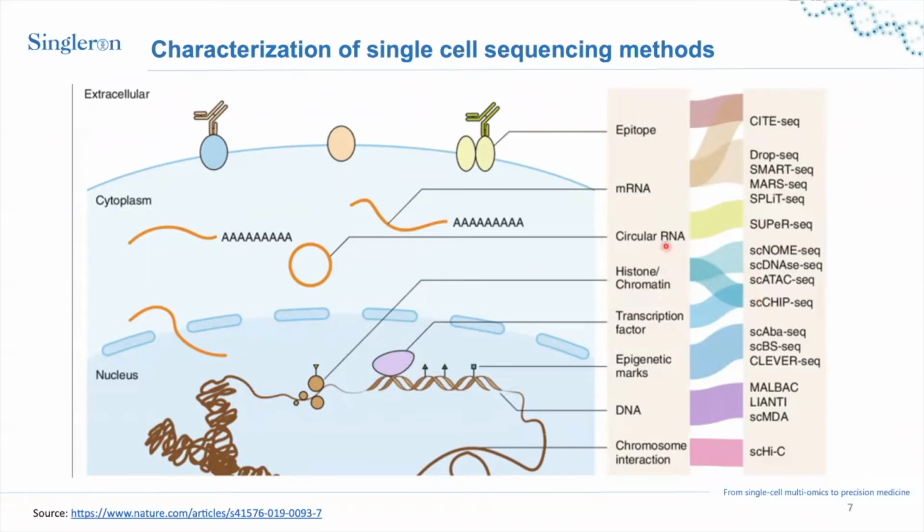And there are also different sequencing methods developed over time for different purposes. So it really depends on your research question. But the majority, if not more than 80% of the single-cell methods are focused on mRNA-based methods, on the transcriptome, detection of the whole transcriptome. And today I want to focus on those techniques that I mentioned here.